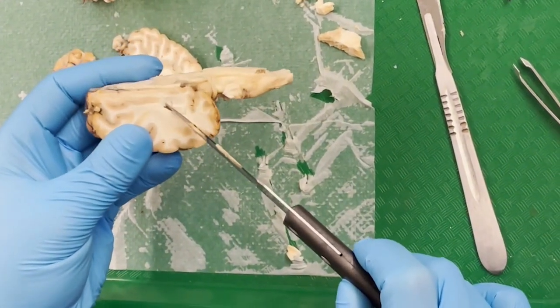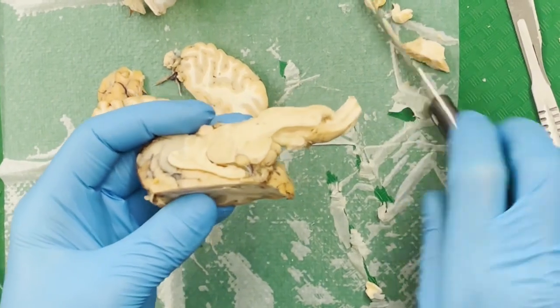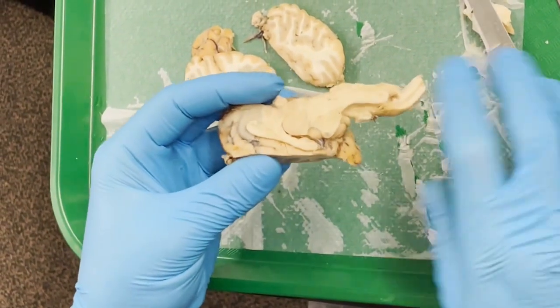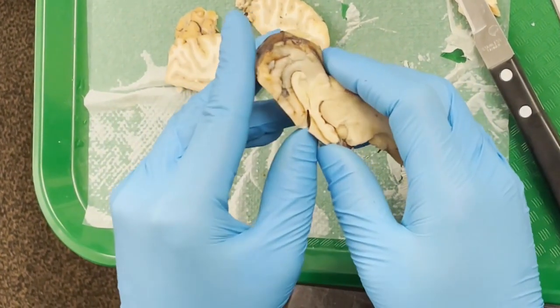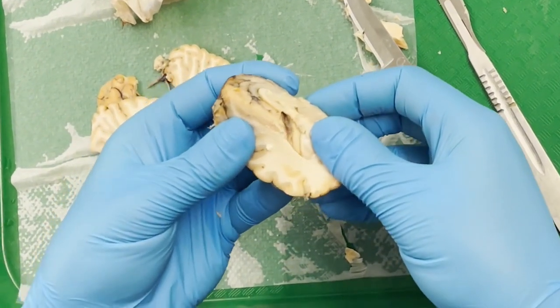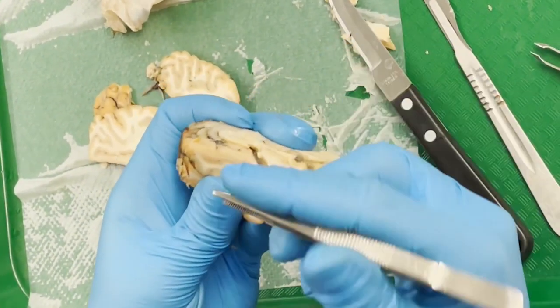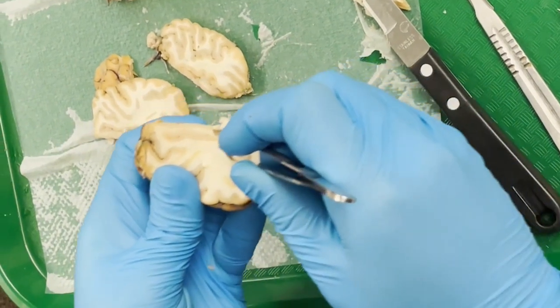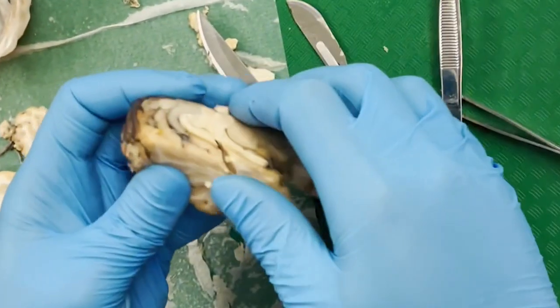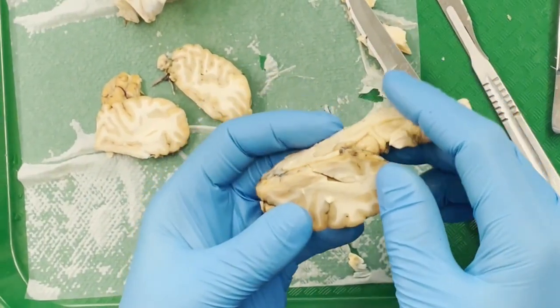To make this process a little easier, I'll take the knife and I'll cut into the brain going this direction to help split it open a little bit. I'll do that again some more. And so now we can start to peel this back a bit. The hippocampus is this thing, we kind of see this whitish bulge on the inside here. It's less beige than the rest of the stuff, okay, if you prefer.